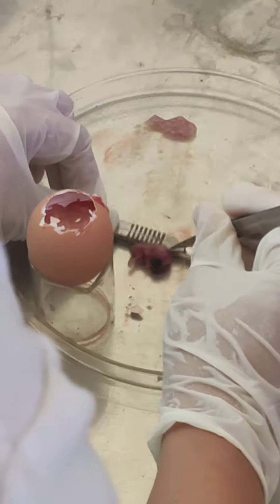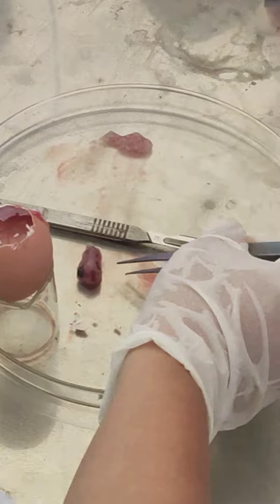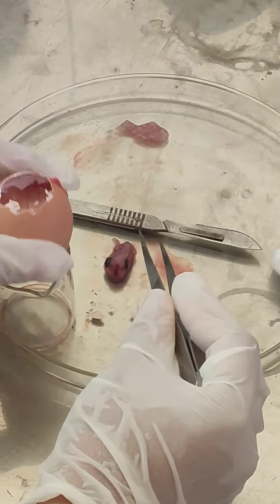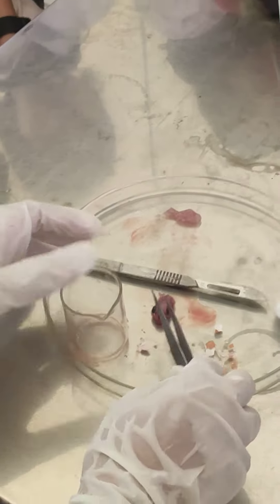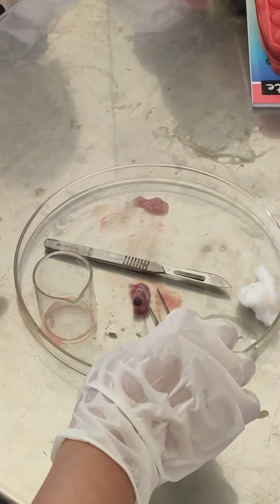I have removed the embryo. Can you see the embryo? What are these two black dots? Eyes. So, these are the eyes. Now, Neti will take over.